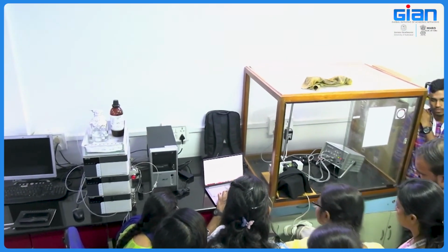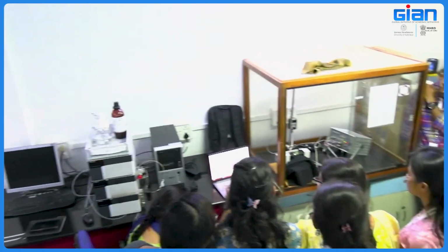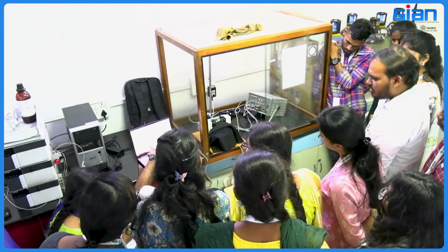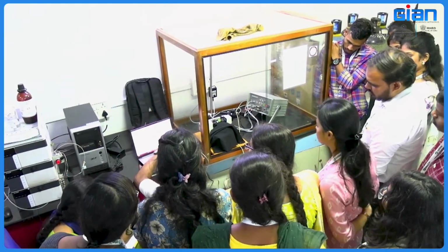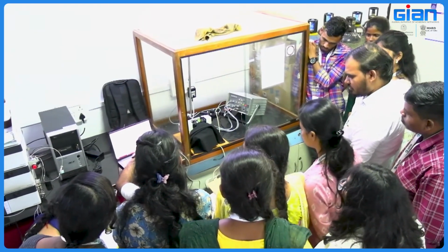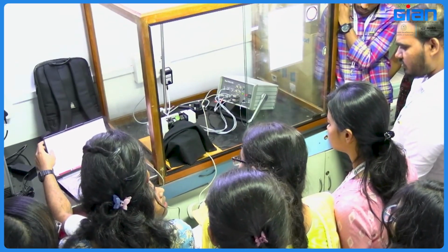What are these points exactly? Basically it is running around 1400 microeinstein. The last actinic light was around 1400, this point. The x-axis is PAR. PAR means photosynthetically active radiation, in microeinstein. So around 1400, or 1401 or 2, might be some point. So this is your last actinic light intensity. This will be your lowest light intensity.